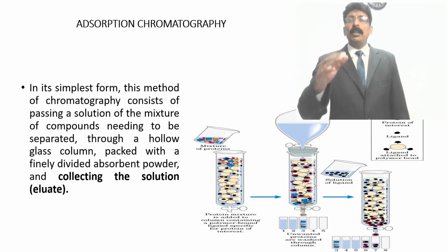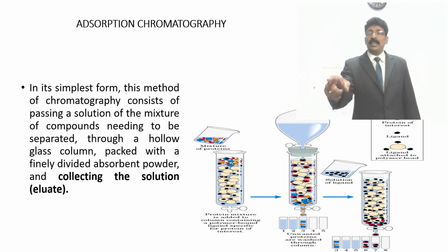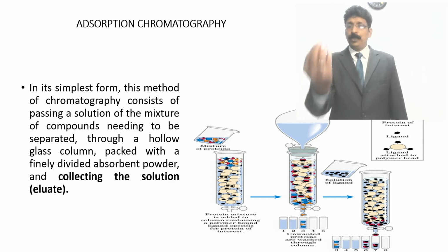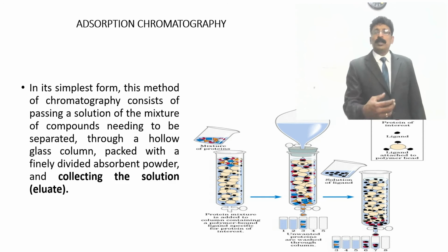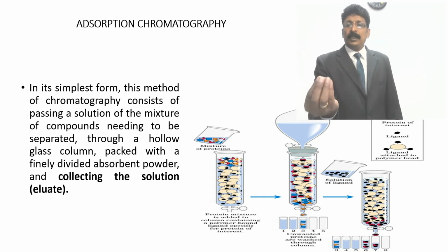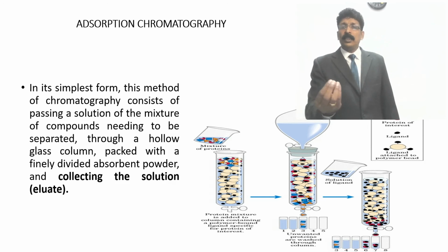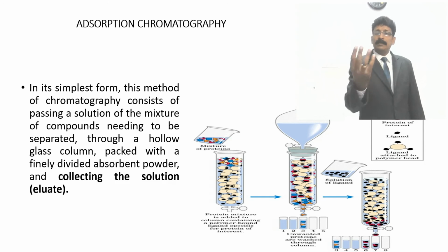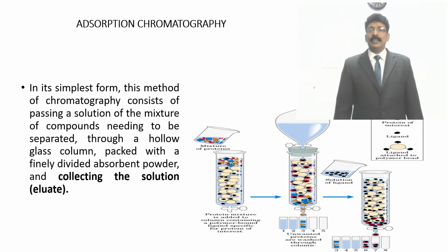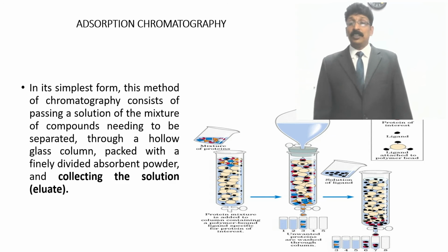So all the other things are removed first. You can see tubes 3, 4, 5, 6, 7 shown down there, that is called the eluate, the solvent which is removed. First, when you remove, you can see the blue and yellow triangle and square shapes have already removed all the other proteins which are not held by that particular ligand present in the stationary phase.